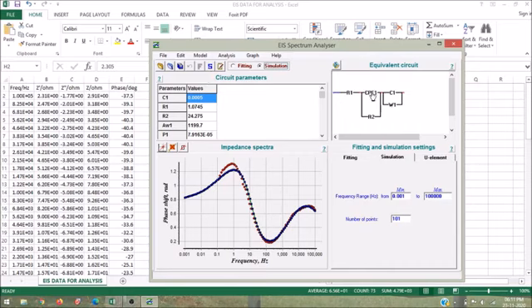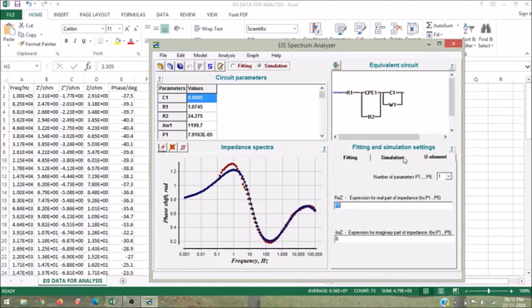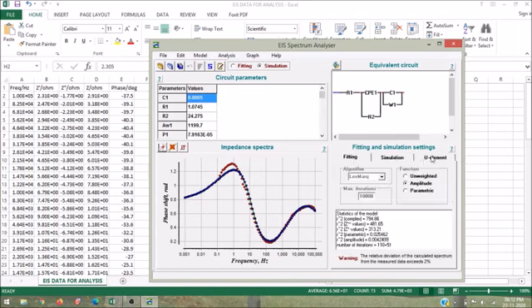You can customize the equivalent circuit according to your requirement. However, there are some problems. If you use it, you will understand that. Still, I think it is pretty good software, and you can get some really cool data, cool fitting using this. There are plenty of other options you can explore, and lots of algorithms and functions are there. User defined element, I am not an expert in defining user defined elements, so let's leave it for the pros.